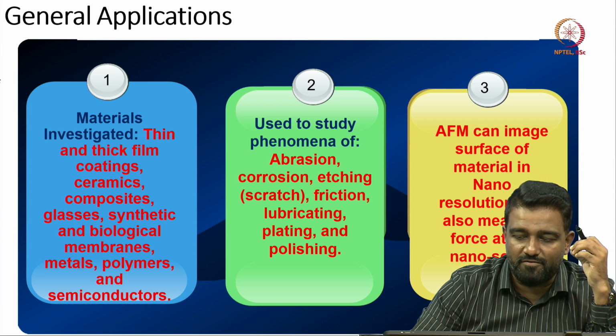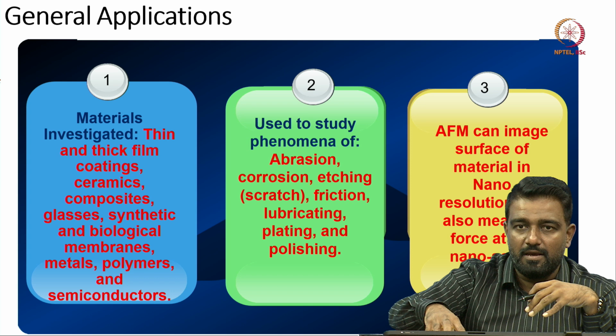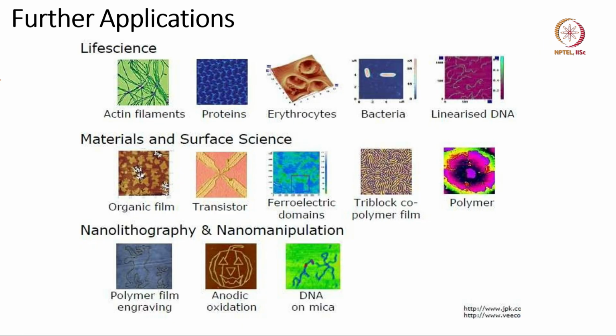The AFM can image material in nano resolution. You can see behind my back. So, can you just put me out of the scale? Yeah, thank you. So, now you can see I can also measure the force at nanoscale, alright. So, that is an important thing.